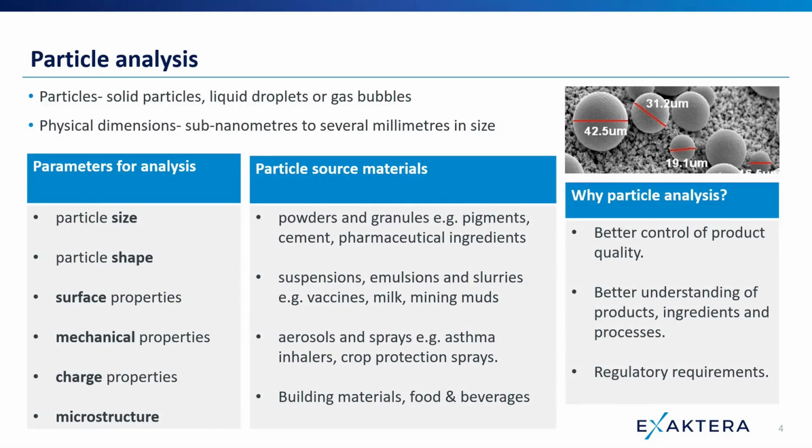So, let's move on to talk about particle analysis. And first, I'd like to extend the definition of particles beyond the idea of finely divided solid dispersed in air. I want to include solids dispersed in other gases, but also liquid droplets dispersed in air or gas as aerosols or sprays, as well as immiscible liquid-in-liquid dispersions. And finally, many of the optical techniques used to study solid dispersions can also be applied to study gas bubbles in a continuous liquid phase.